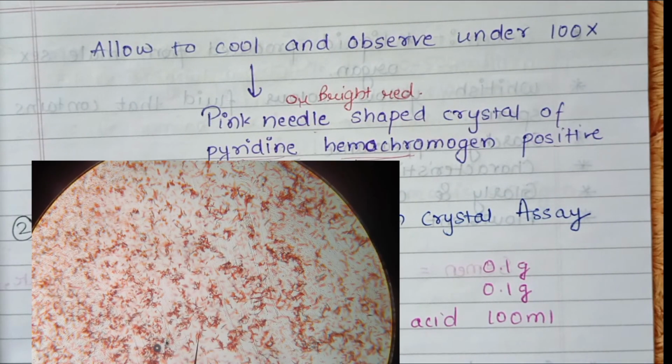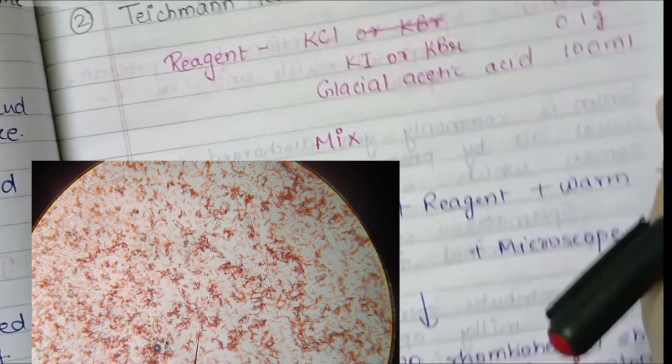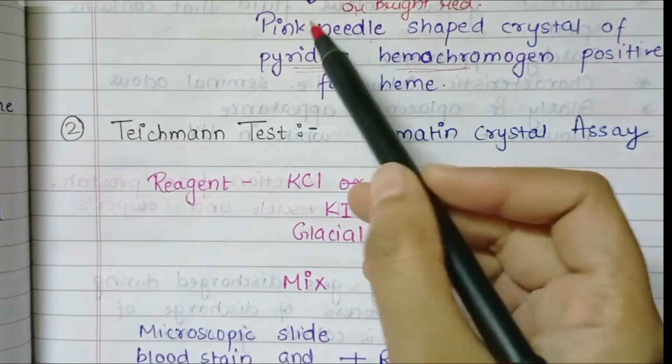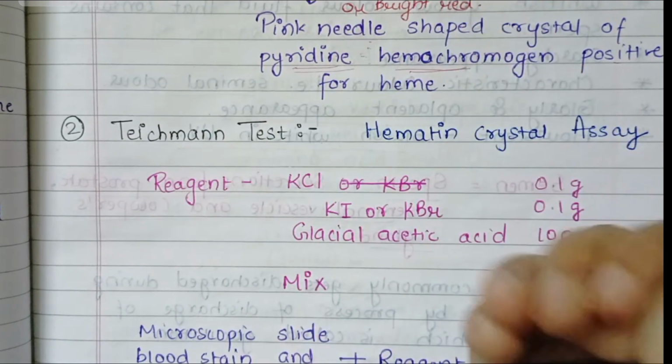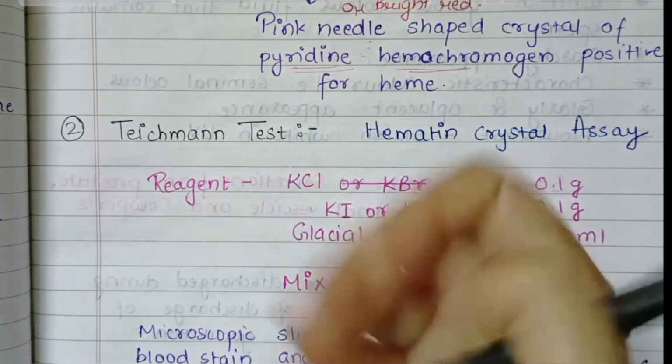Have a look at this image. The crystals look somewhat like this. And this is very important because this question is asked in the NET examination: what are the crystals made up of in the Takayama test?